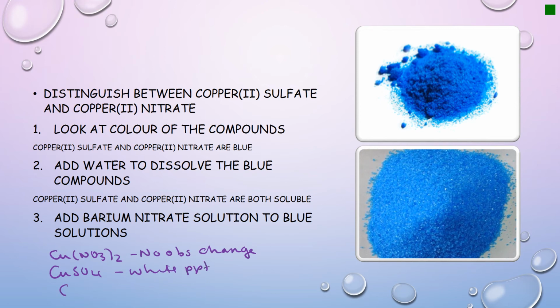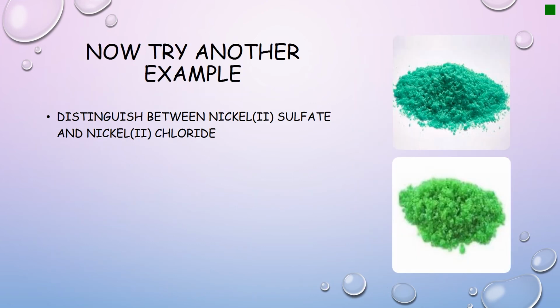So the reaction was copper sulfate and barium nitrate gave us barium sulfate plus copper nitrate solution, and hence we have distinguished them.